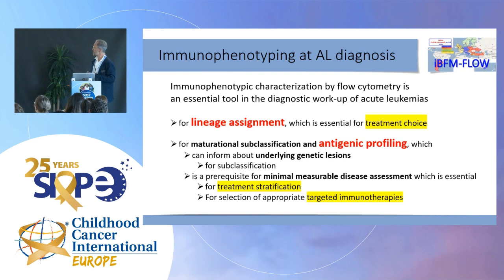this type of assessment? Flow cytometry is a quick methodology. So on the same day you have the result. This actually offers many things in adequate time, where genetic and molecular methodology takes much longer. To make a decision. So the first decision you have to take is, if you have a new leukemia, to assign lineage.